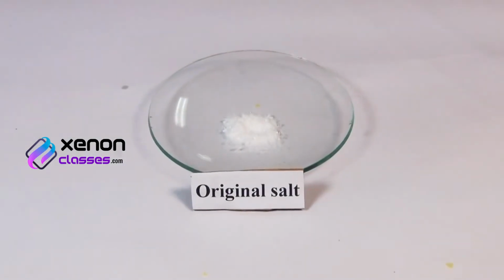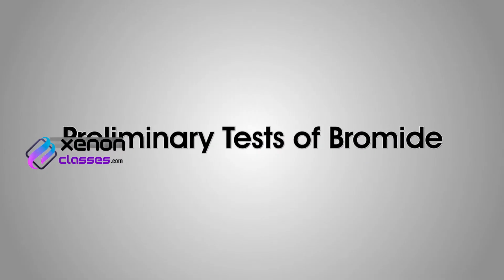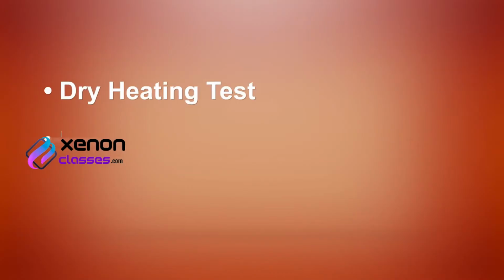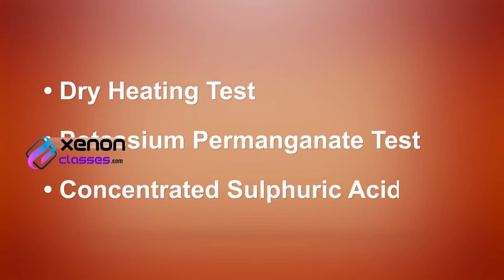Our aim here is to test for the presence of bromide ion in a given salt. Let's see the preliminary tests for bromide. The preliminary tests are dry heating test, potassium permanganate test, and concentrated sulfuric acid test.